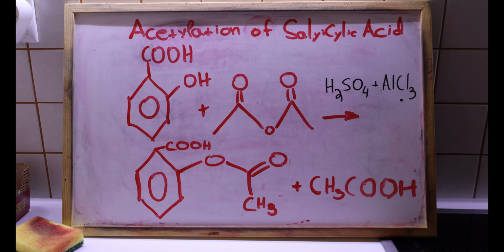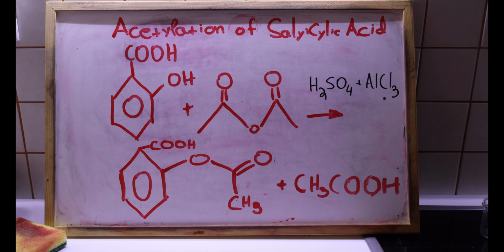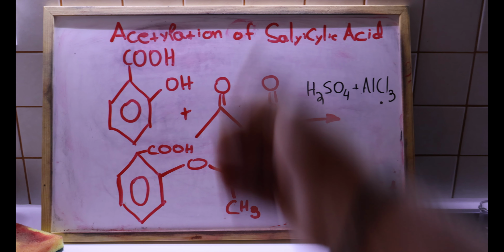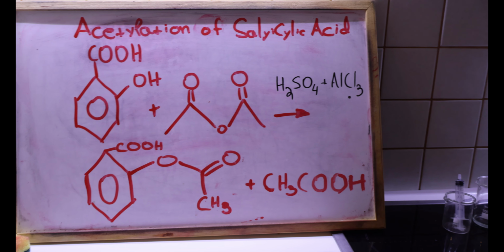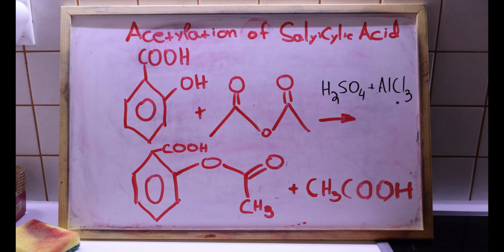We are reacting in essence an anhydride of an acid, of acetic acid, with an alcohol, a phenol, to create its ester, which is the acetylsalicylic acid.